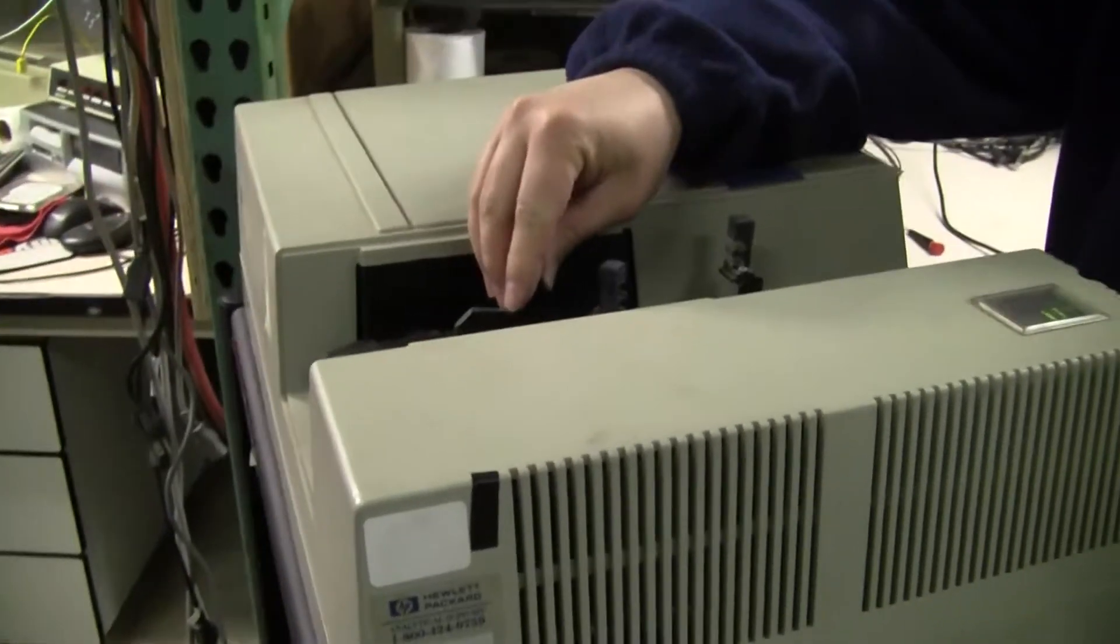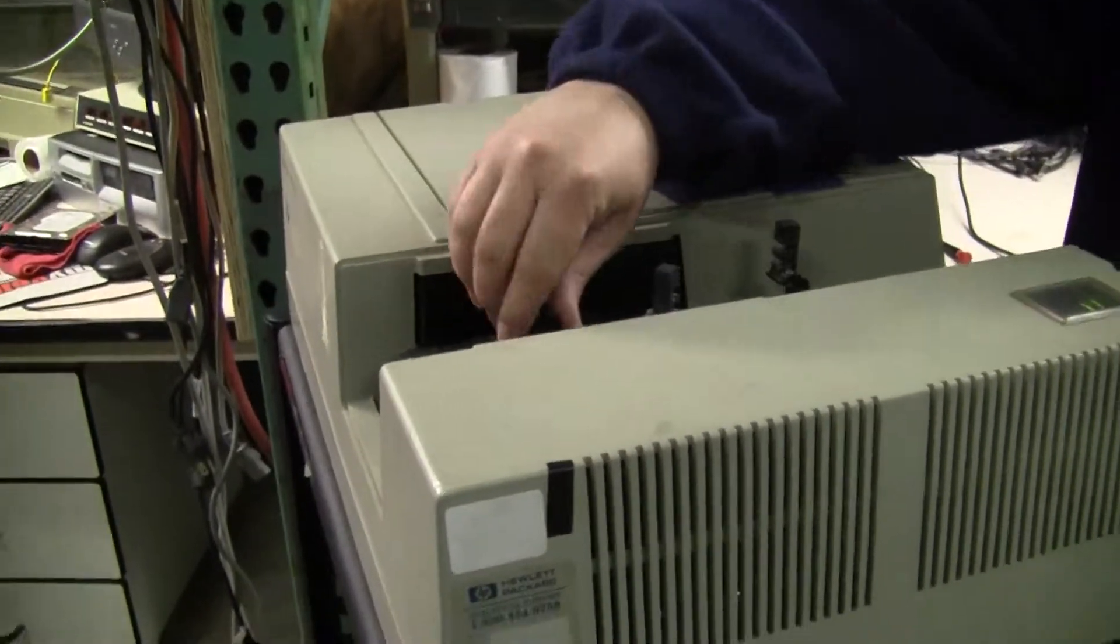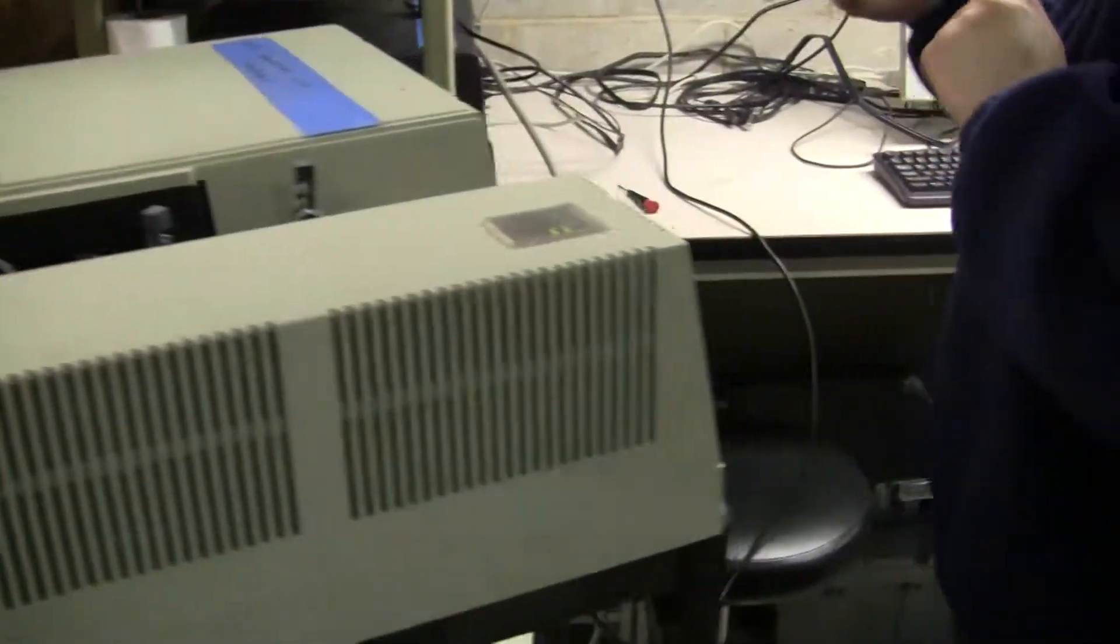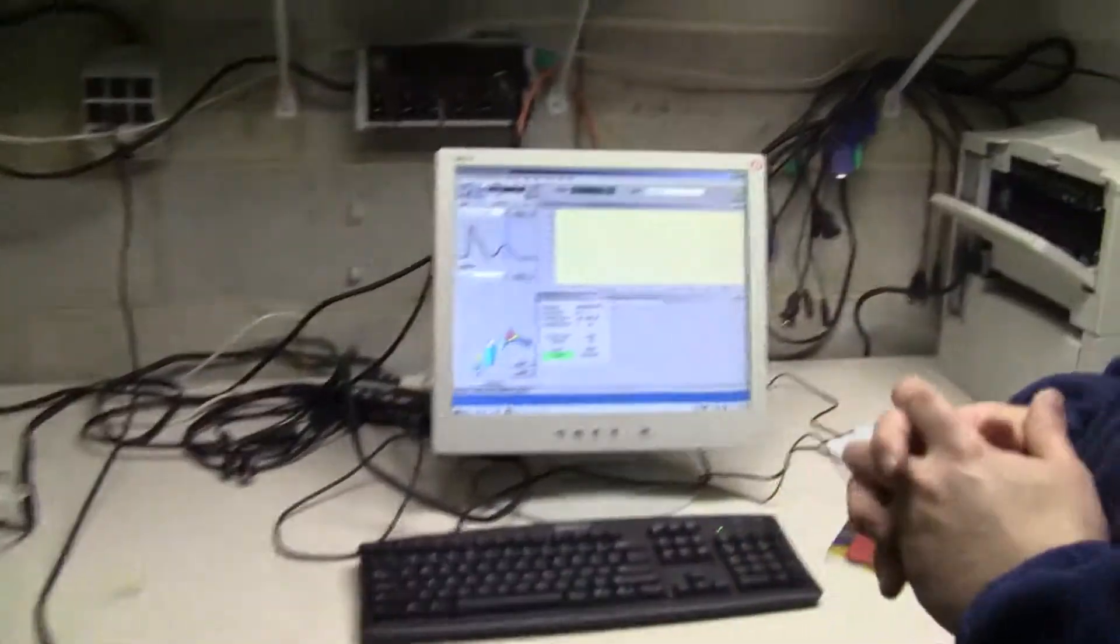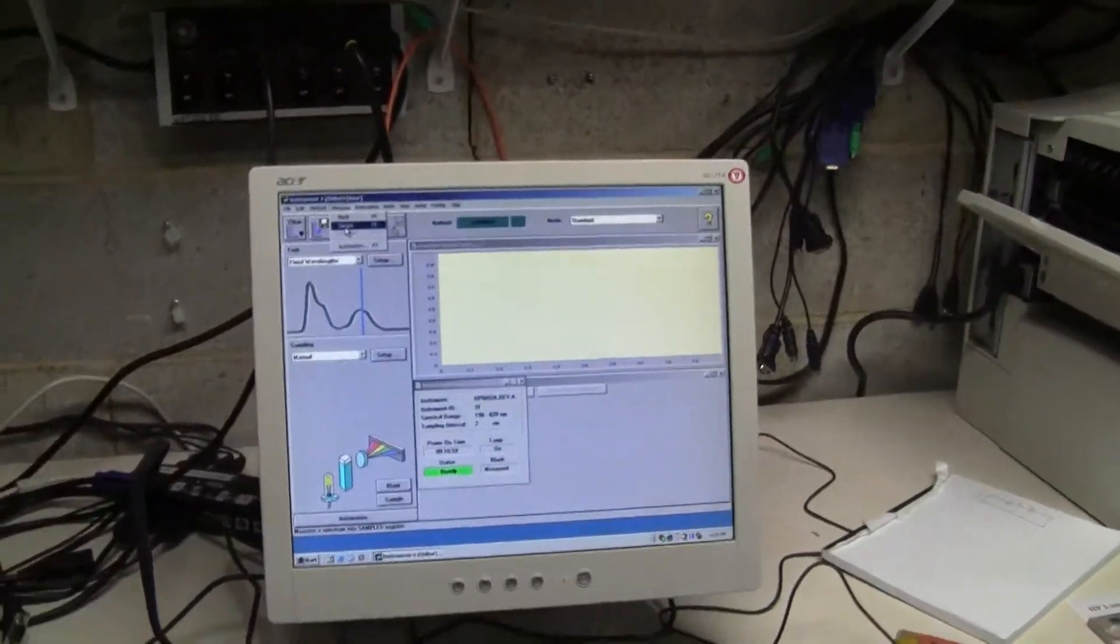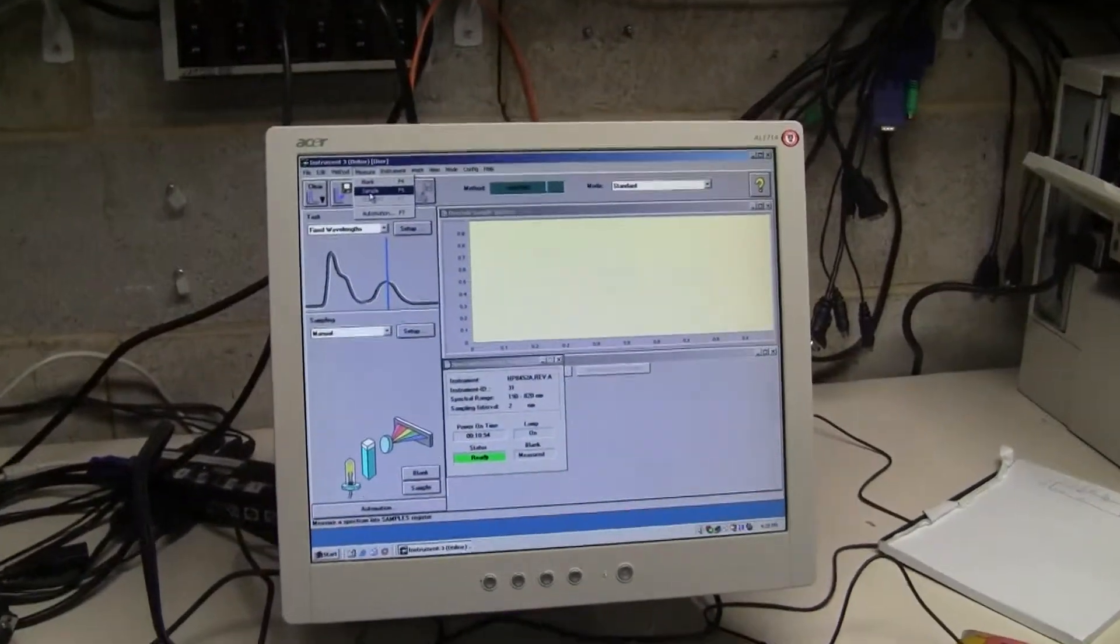I'm just going to put our standard in, lock it in. Coming over to the computer, this is running a Windows 2000 platform of Chemstation.